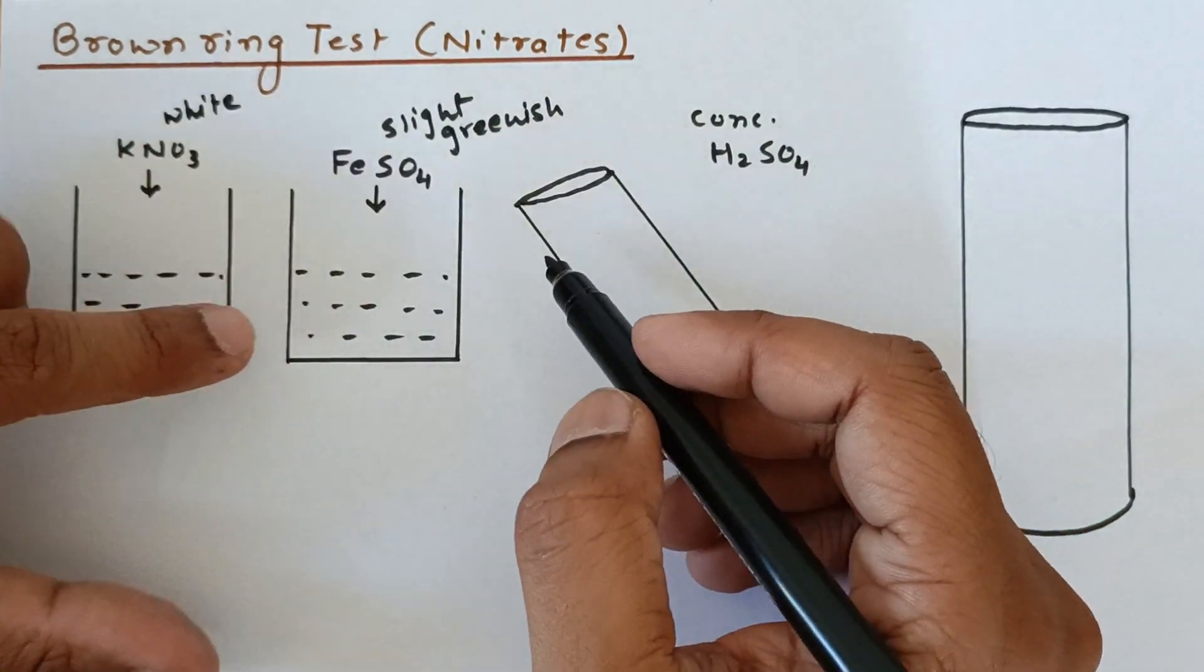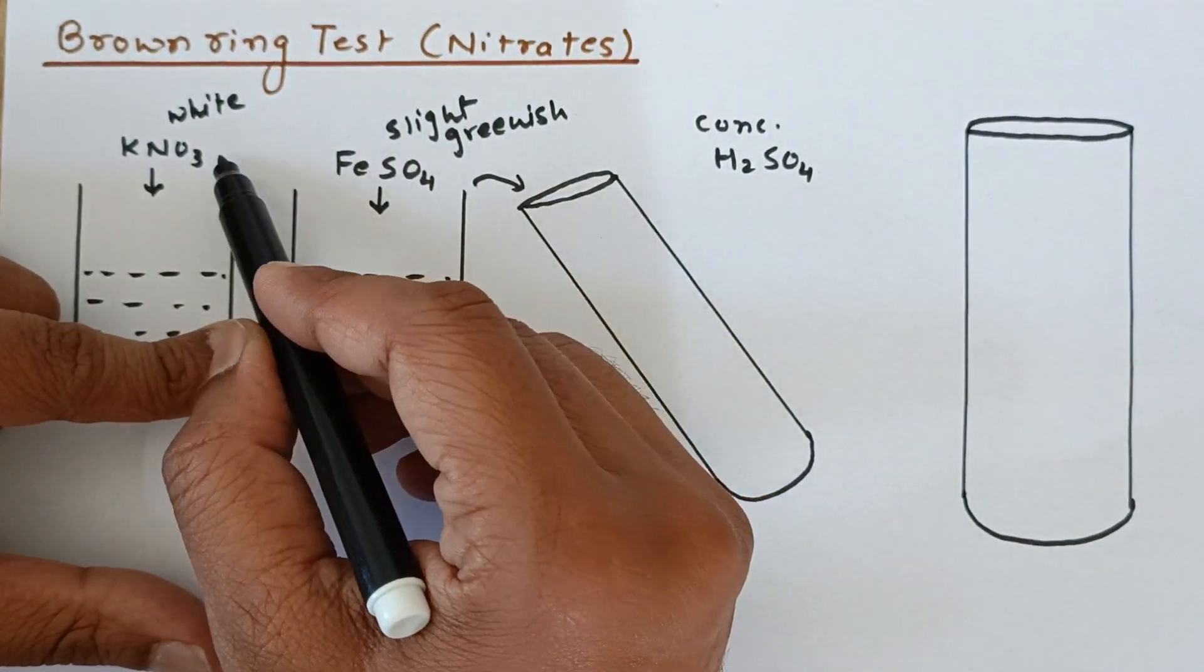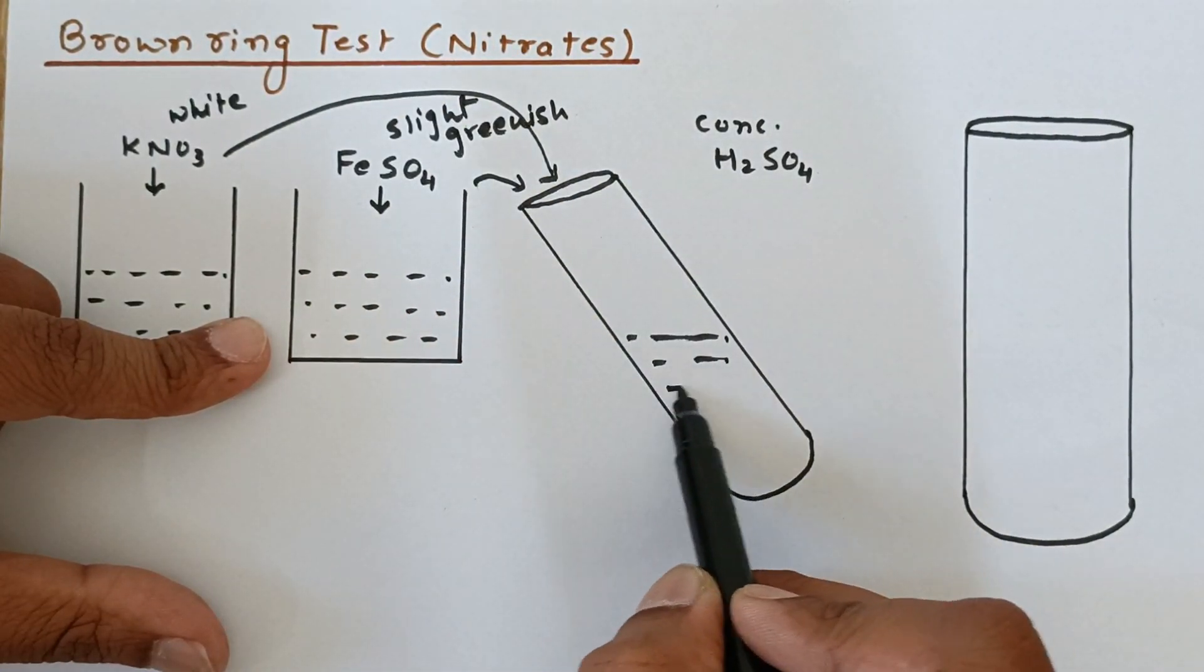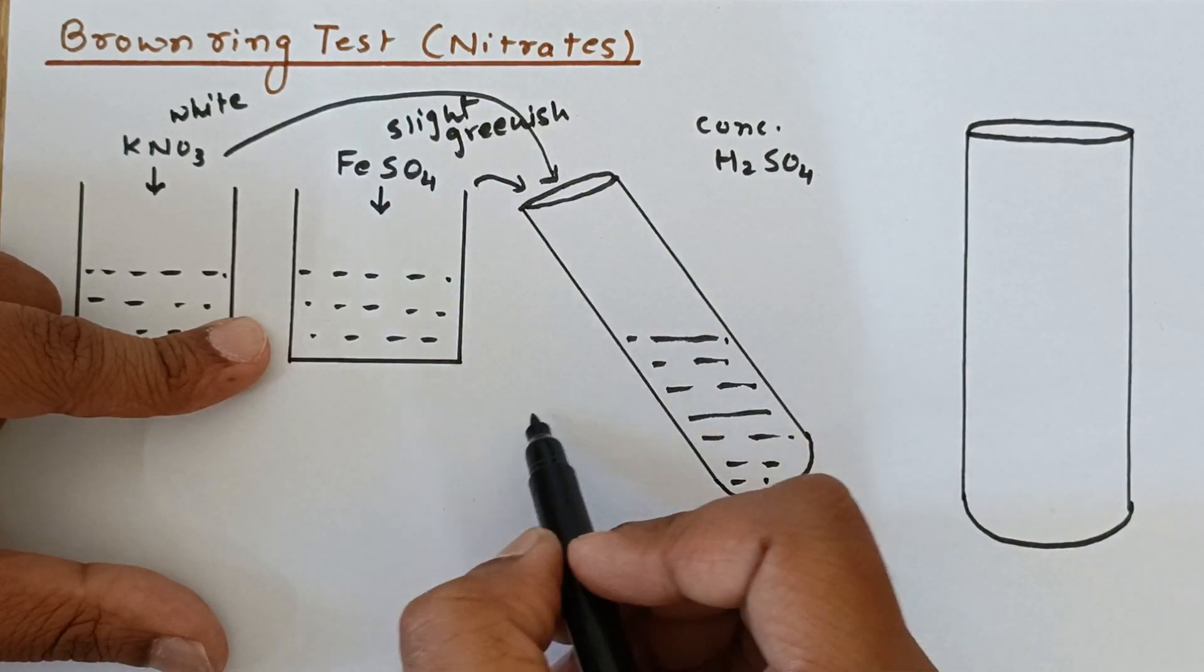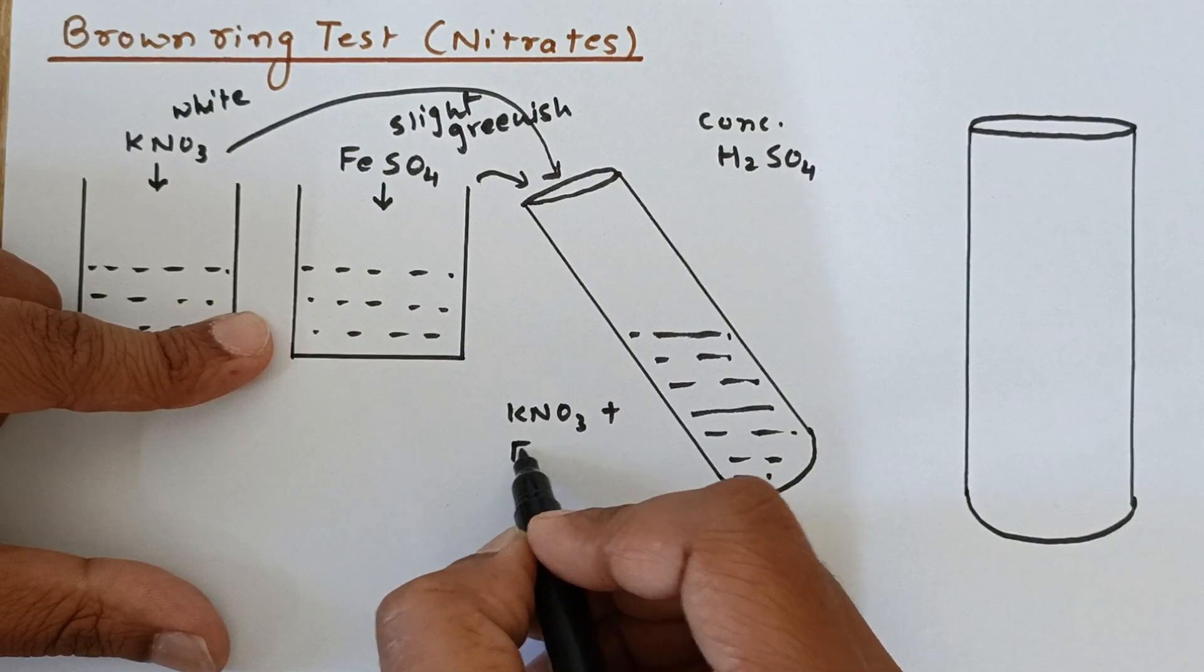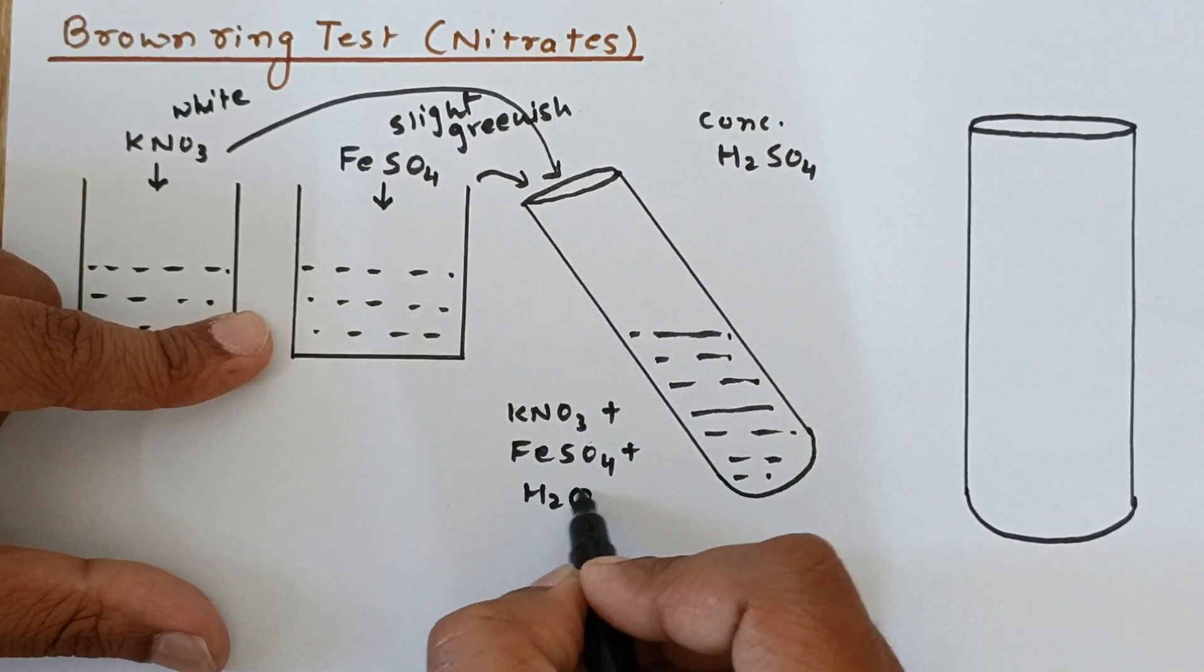Now what we are going to do is we are going to add these two solutions in this test tube like this. Now we have a mixture of KNO3 and FeSO4 plus we have water as a medium.